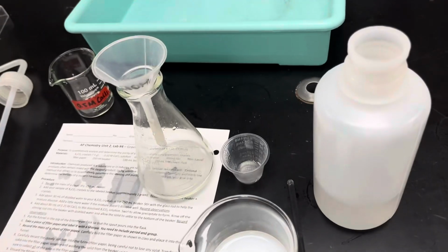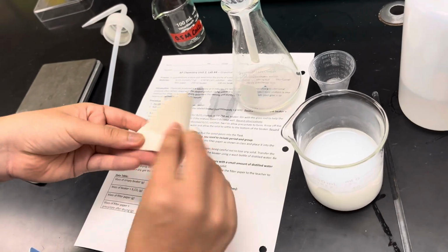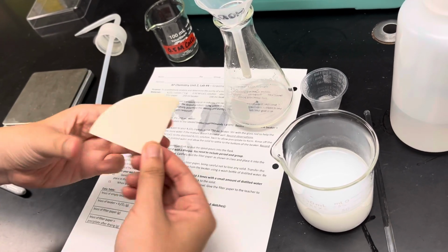So now I'm going to fold the filter paper like this. I need to fold it in half like a taco, and then I need to fold it in half again like a pizza slice. And this is going to help me catch all of the precipitate.